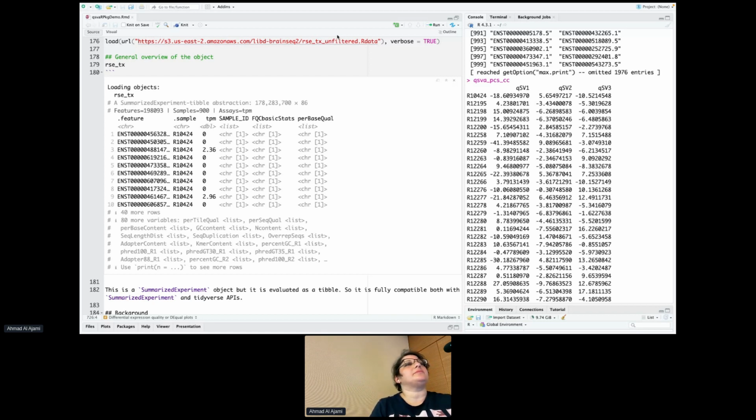I don't know what you're processing the data with, but you can also get raw counts, and the authors of Limma don't recommend using TPMs; they recommend raw counts. In this project, we were more interested in getting the transcripts associated with degradation from the pipeline, and that's why we used TPM. It's RNA-seq.